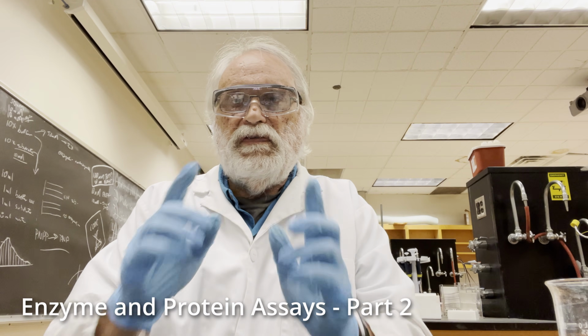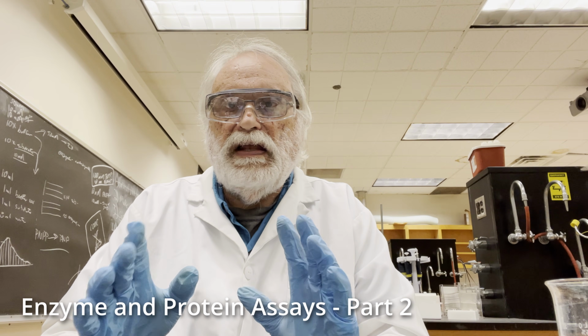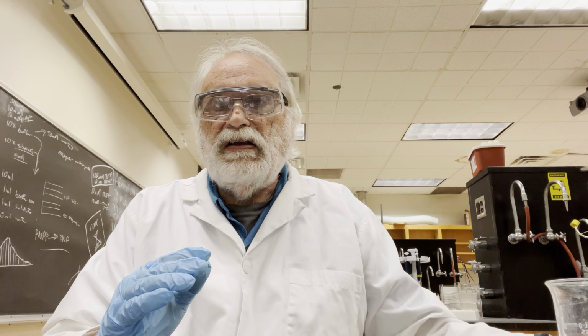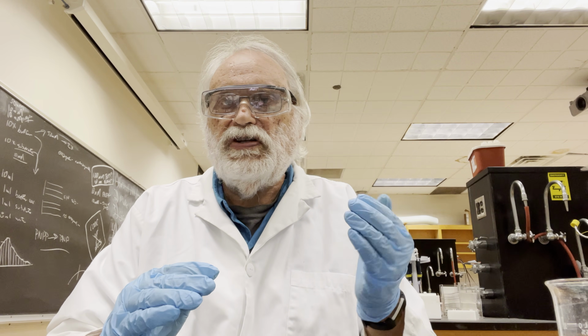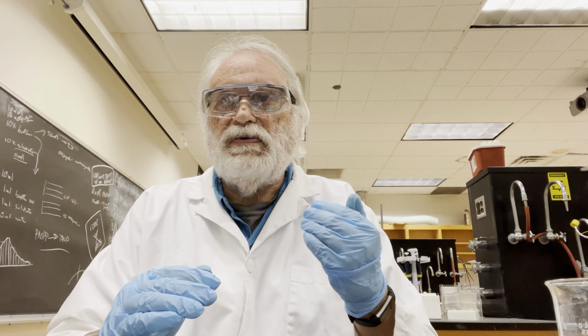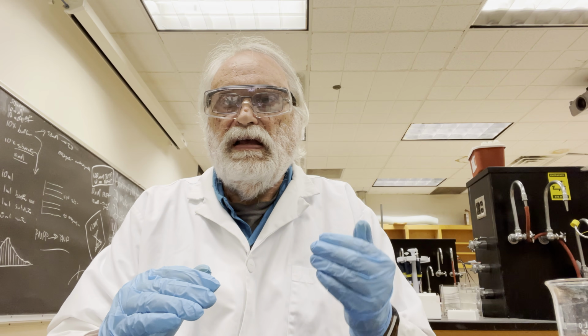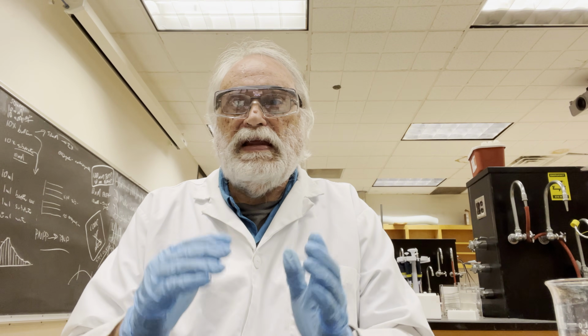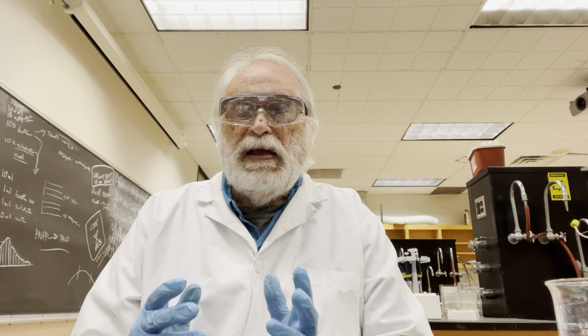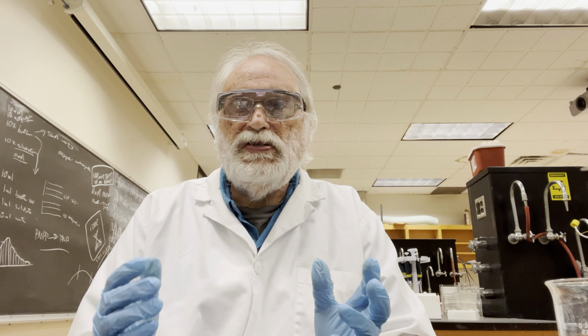Hi everyone. What we've done already today is we've gone ahead and done a plate, which is sitting off to the side here. The enzyme assay is incubating, and it's generating phosphate from the PNPP. The next thing to do is a protein assay. And you might wonder, why are we doing a protein assay?